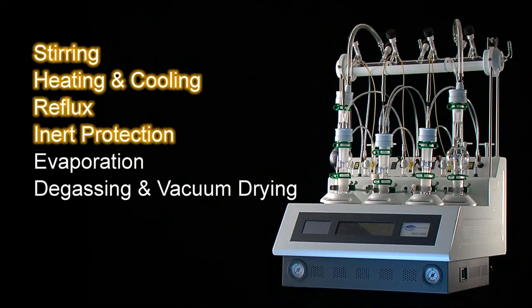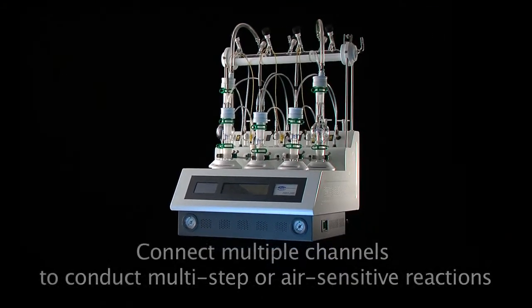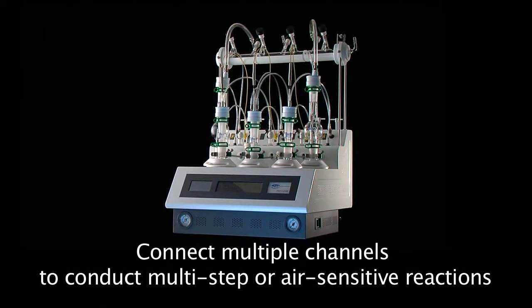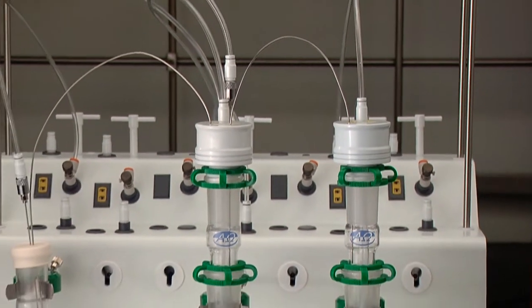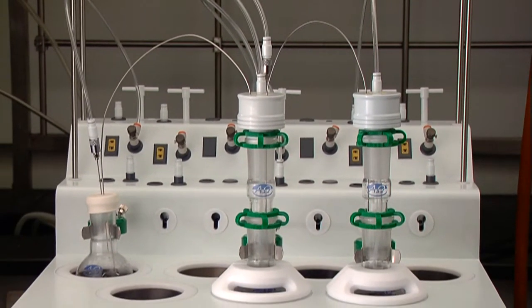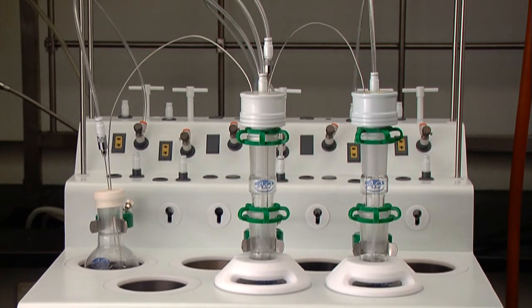Now, we'll show you how to connect multiple channels to do reactions on Pro7. Pro7 is especially practical in multi-step or air-sensitive reactions. For example, we use three channels to conduct the Grignard reaction.